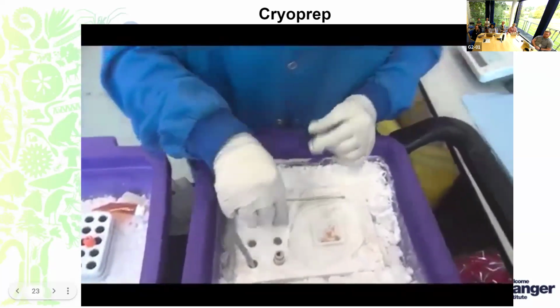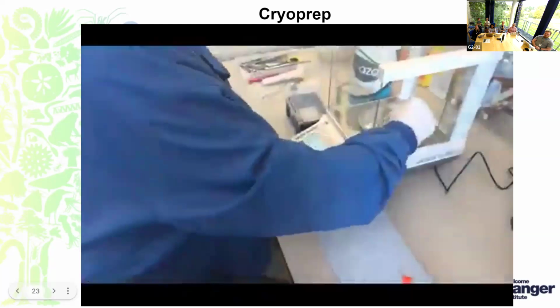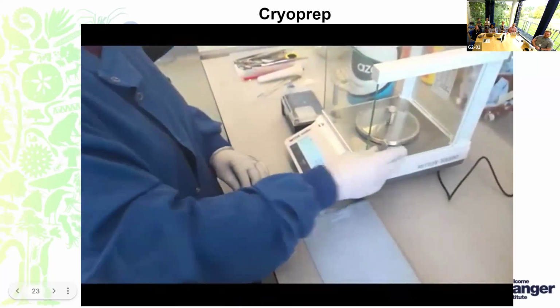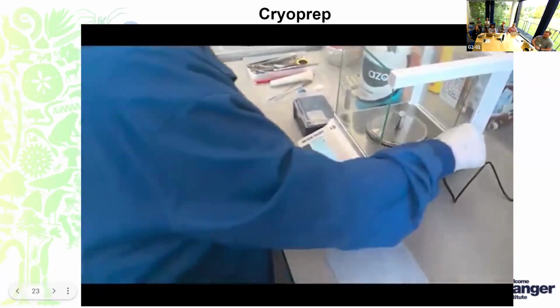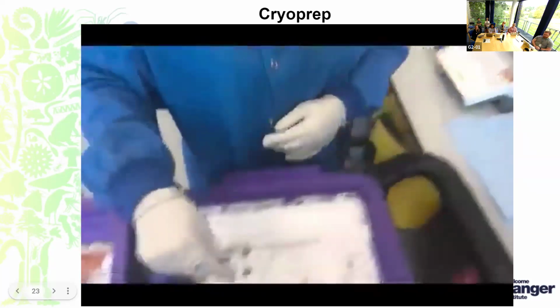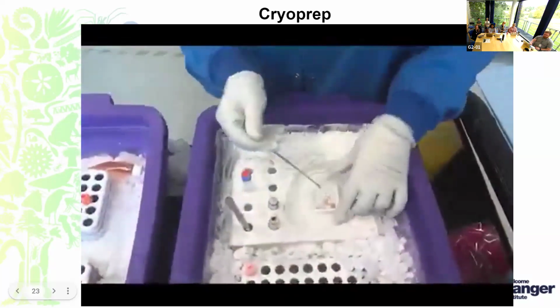Once the sample transfer is done, we move it to its required storage boxes, and then it gets extracted or sent for Hi-C, or it gets sent for RNA extraction.